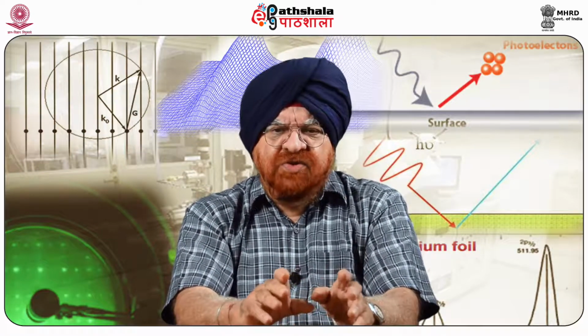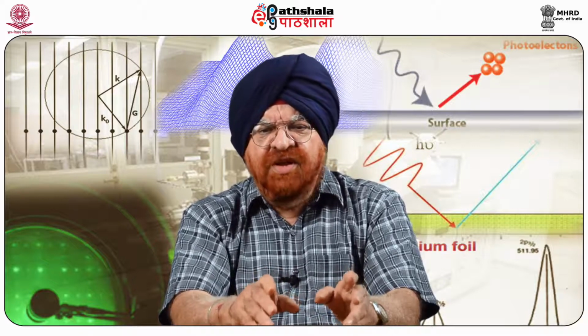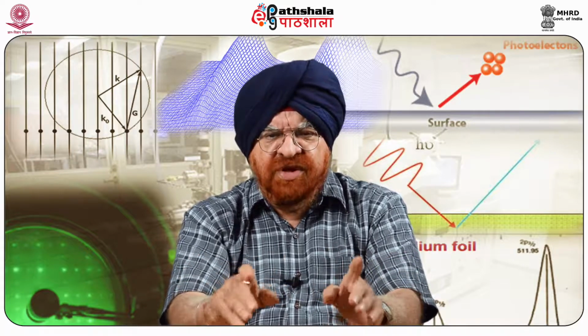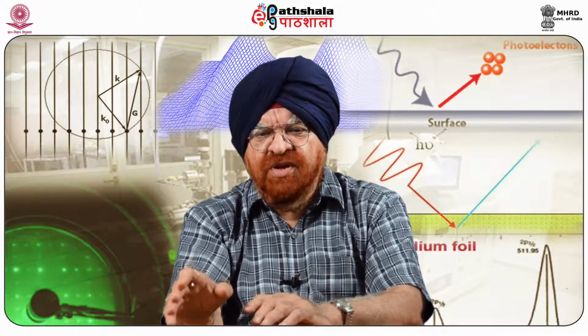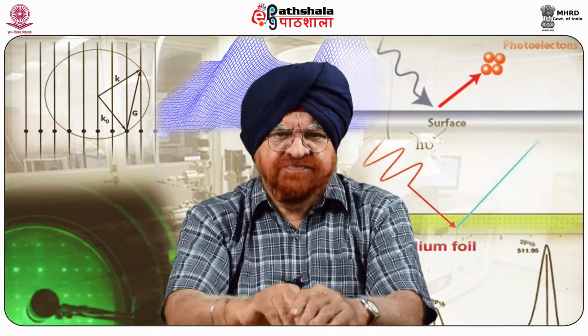Since the mean values do not overlap, these chemically distinct functional groups may be differentiated by measuring the adhesion forces with a tip that terminates in a defined functionality.